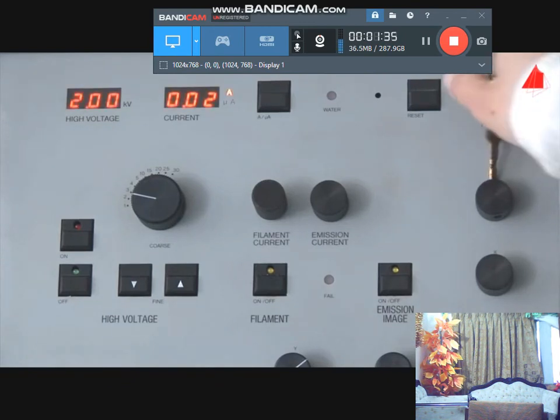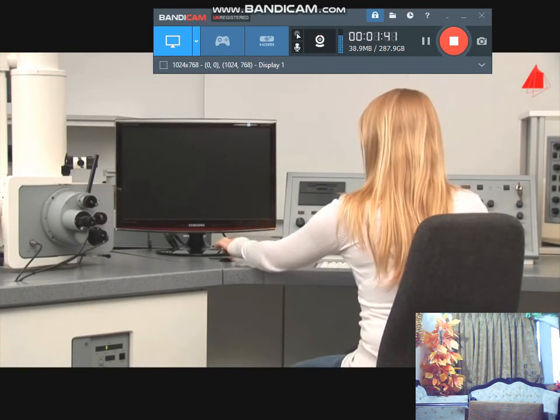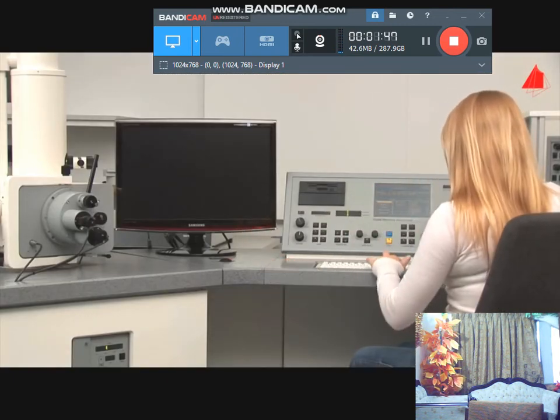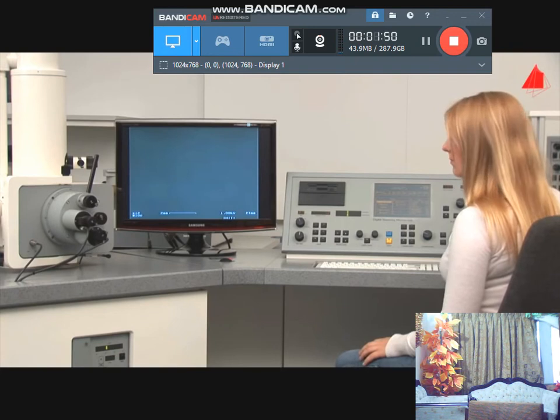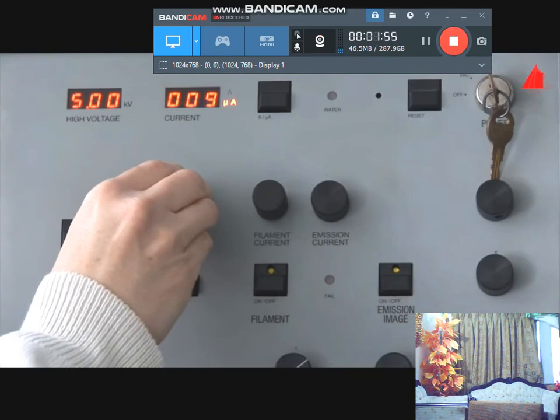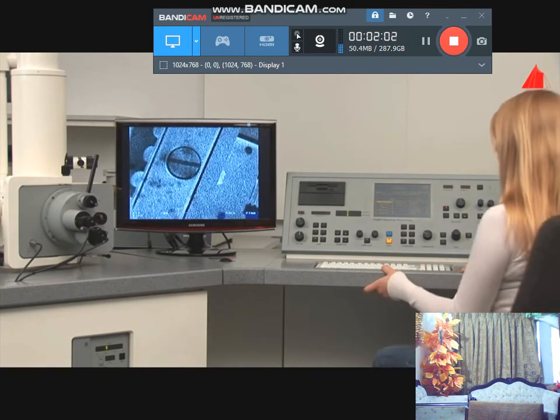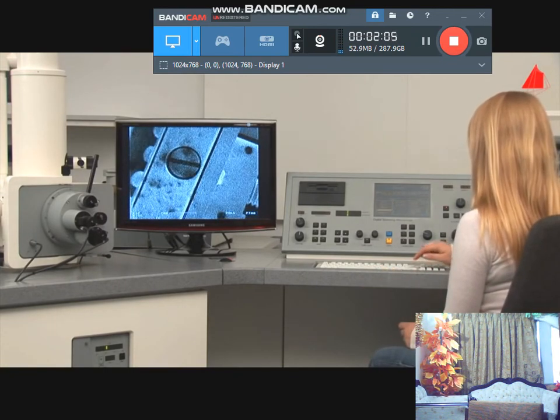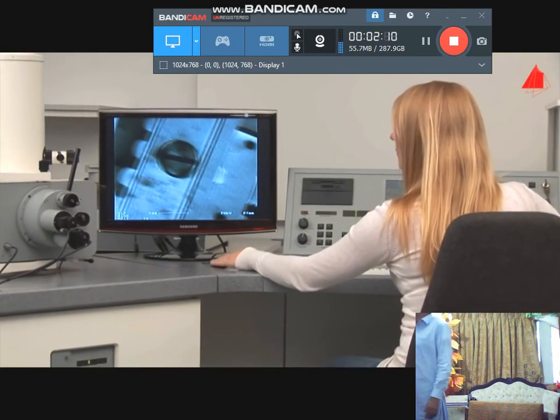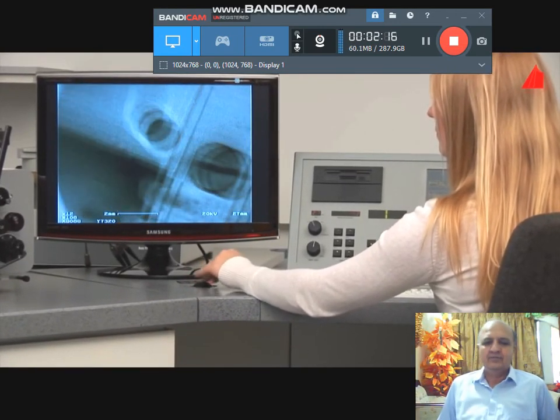It takes about 3 minutes to obtain a sufficient vacuum in the specimen chamber and column. Meanwhile, she turns on the monitor, initializes the motorized stage and boots the microscope control. Only now she is allowed to switch on the high voltage and the thermionic cathode. For the first time, a reasonable image appears on the monitor. It shows part of the specimen stage. Using the trackball, she moves the stage within the microscope. She looks for the place where the first sample is positioned, the used filament.